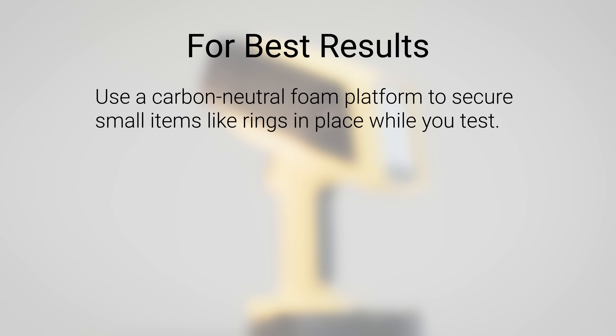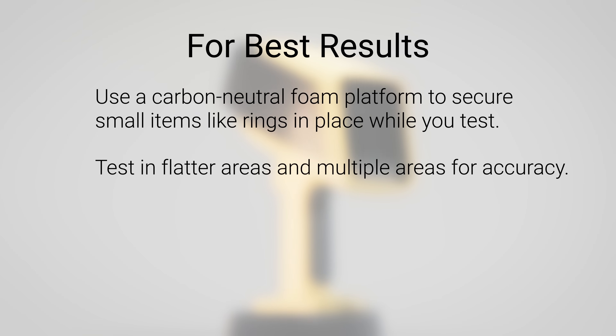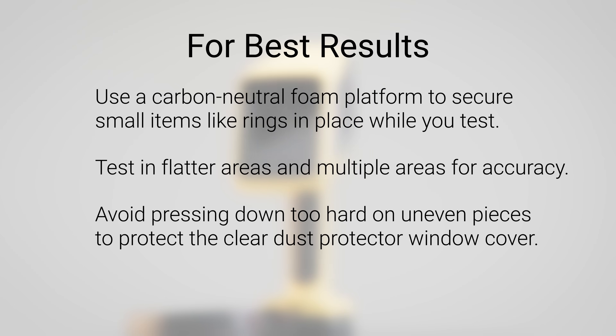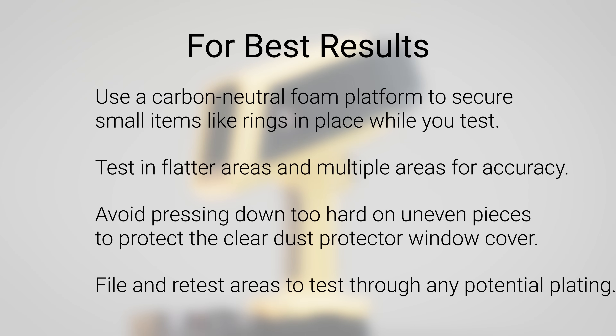I suggest testing in flatter areas and testing multiple areas for accuracy. Don't press down too hard on uneven pieces — you don't want to scratch the window cover. If you're testing plating, you may want to file and retest areas to make sure you're not just analyzing the plating.